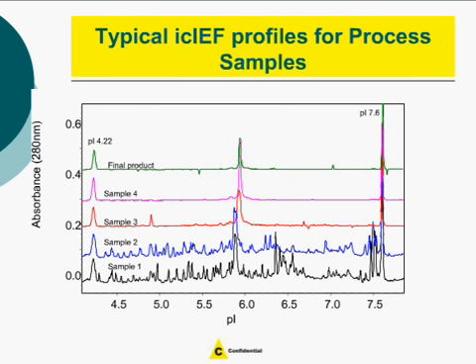This figure here shows the typical electropherogram for the types of samples that we needed to analyze. And during product development, titer yields need to be analyzed early in the process in upstream samples such as lysates, as well as after downstream purification steps. And this poses somewhat of a challenge analytically, since the crude lysate samples contain many other cellular proteins in addition to lipids, carbohydrates, and cell culture media components.